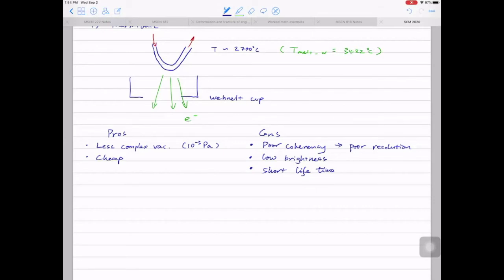I believe so, yes. By the way, the filament itself is very hot, but the specimen is so far away from the gun that the heat from the gun does not affect your specimen. I take it the low intensity on the tungsten filament probably correlates to a little less sample heating than in some of the field emission guns? You can say that, but it's always a compromise. If you want to reduce the heating of the sample, then you don't get the signal to noise ratio, so you get a noisier image to look at.